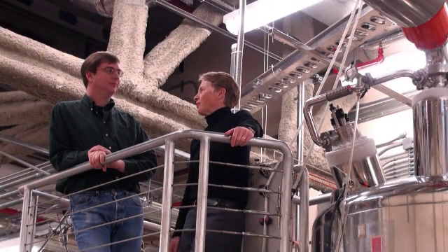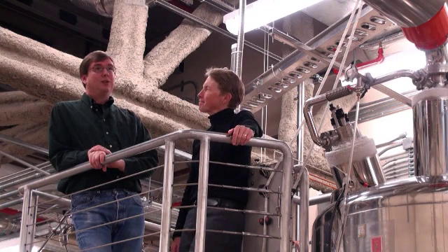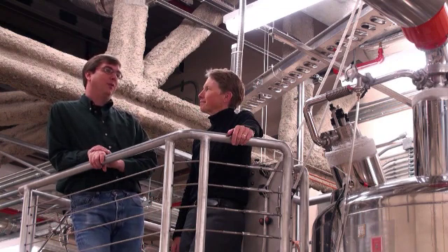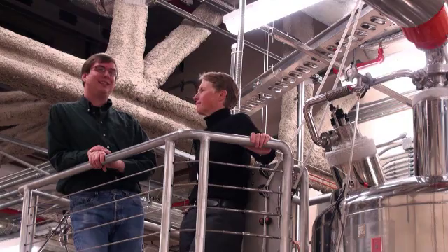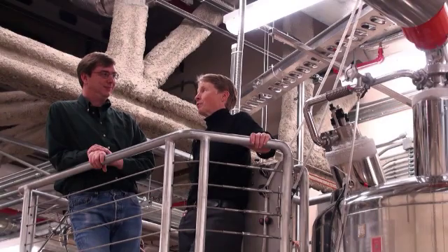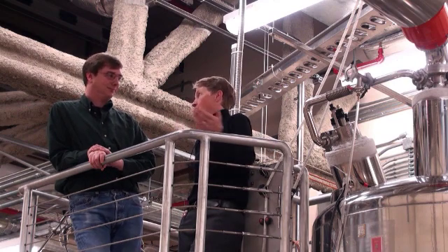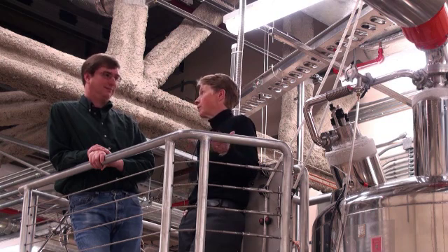Great. When I do these interviews, I always let the interviewee ask a question or two. You got one for me? So one of the more exciting things that's just happened recently is we've been working with Bruker, the NMR vendor, on dynamic nuclear polarization. What are the chances of getting a DNP instrument here? I think that's something we definitely want to explore getting. And so by doing the experiments with Bruker that you guys are doing now and testing out the types of analyses that you can do, it's going to help us build our case for BER, which is ultimately what we have to do to get the capital money.